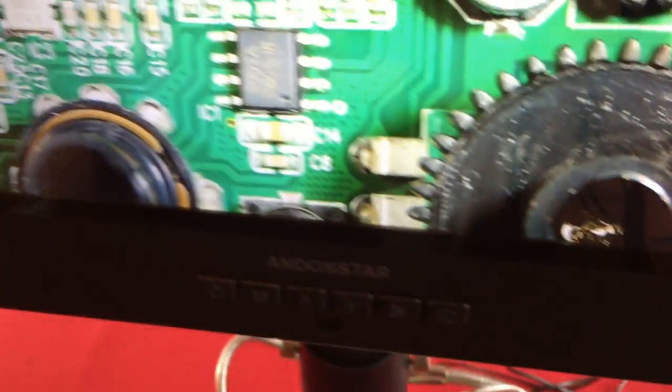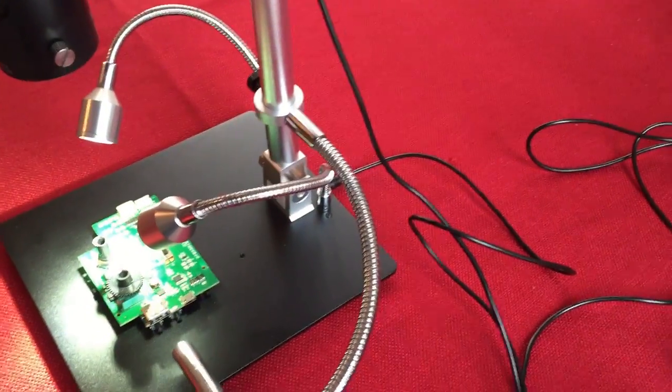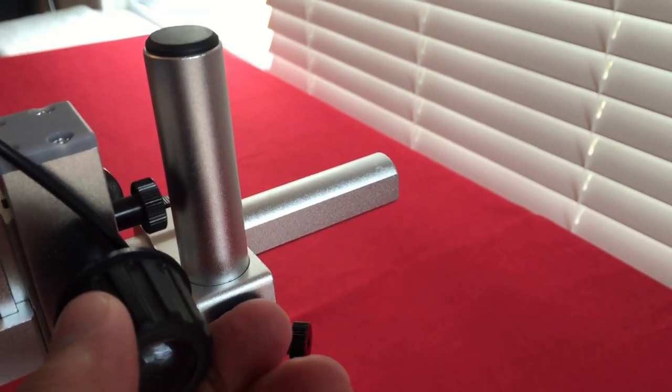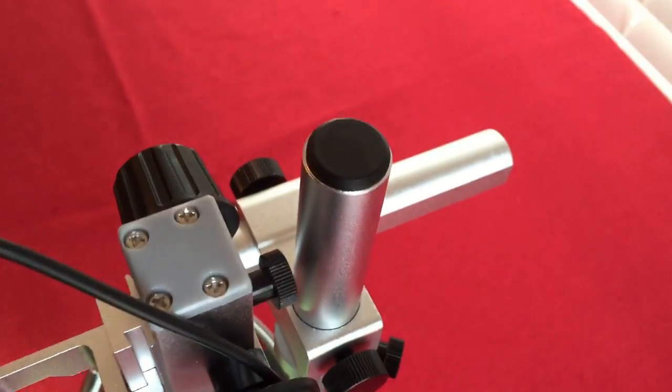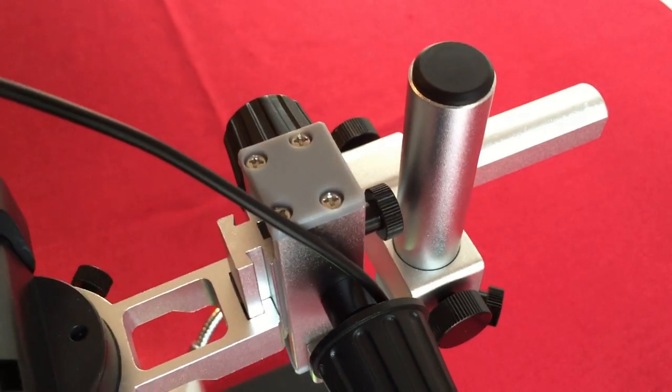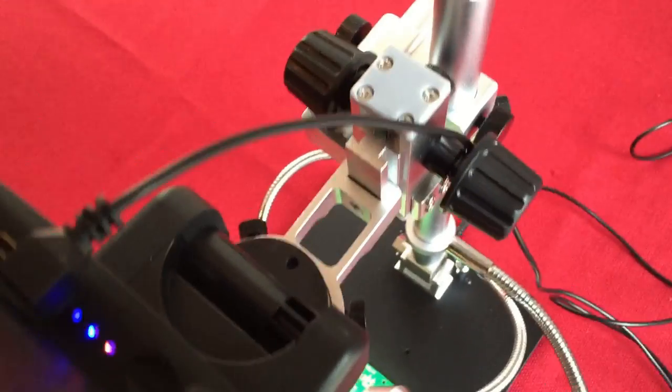Looking at the cool controls, I'm going to show you the remote and all the modes. Going to the backside, you can see the mounting hardware and how it's all set up. There's a retaining ring so this doesn't slide down, and up and down adjustment knobs with microfine adjustments. It's all aluminum and very well built. There's also a boom going front to back. In the back of the monitor there are a bunch of connections.